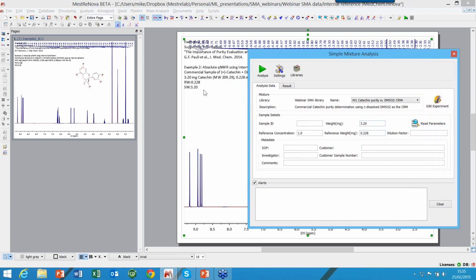So you can put these sample-specific numbers into that file to give SMA a hand. And in fact, this is very, very important if you're doing batch processing or real-time SMA. You have to do it this way. Okay, I've got those masses in there. That's all I need to do. I don't need that today.